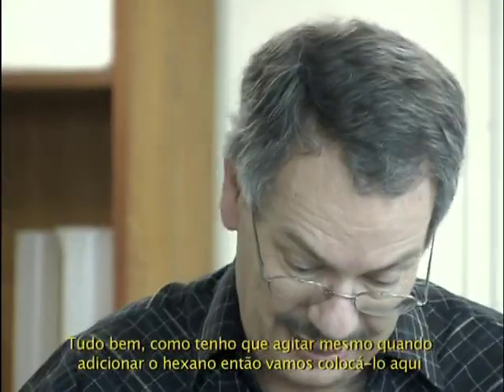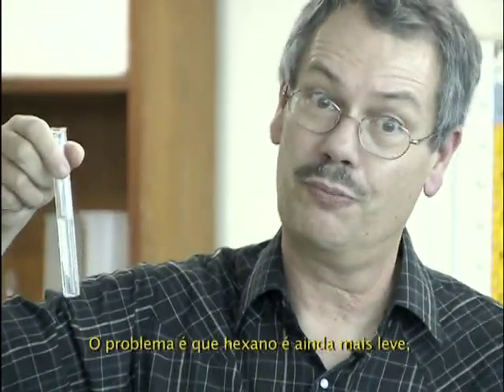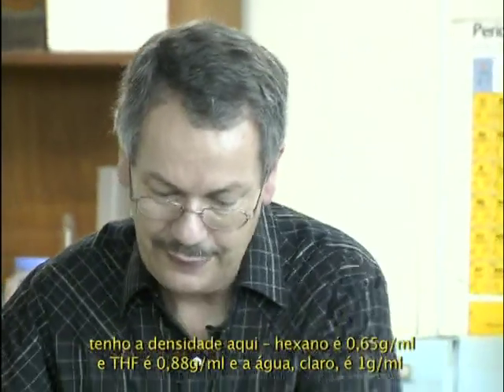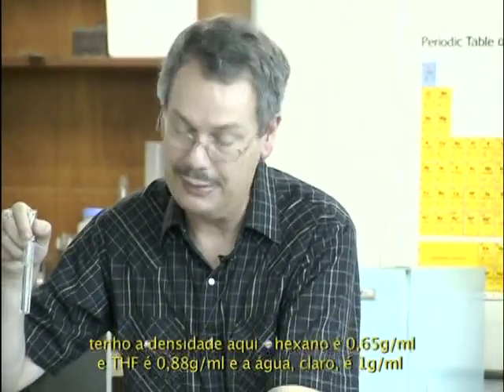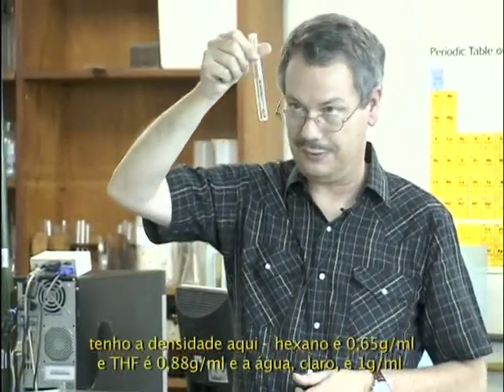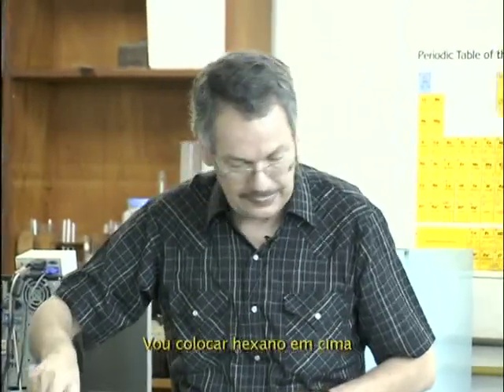That's no problem. Since I have to shake anyway when I put hexane, I'll put hexane in this. With the problem that hexane is even lighter, I got the density somewhere through Susanna. Yeah, hexane is 0.65 gram per milliliter and THF is 0.88 gram per milliliter. And water, of course, is 1 gram per milliliter. So it doesn't matter. I will put hexane on the top. So this is water, it's done. And now I'll put hexane.